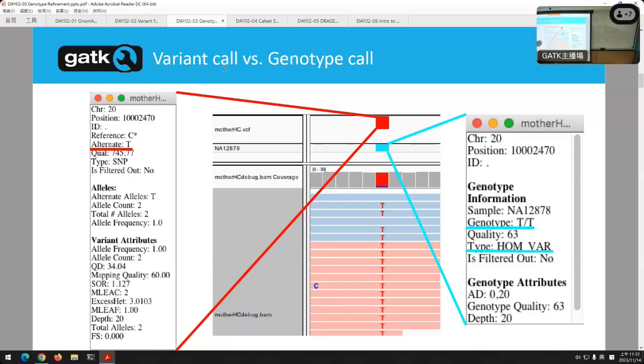Okay, somatic mutation is a good answer. That's fine. It could be contamination from another sample. Sure. Those are terrible things, but those are possible. There's many other reasons. The sequencing is imperfect. The alignment is not perfect. Could be, again, bacterial contamination also. So there's many, many reasons you'd see something like this.